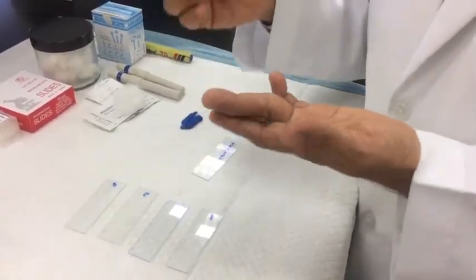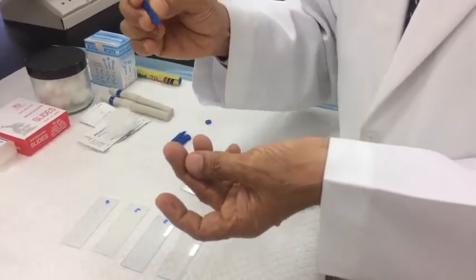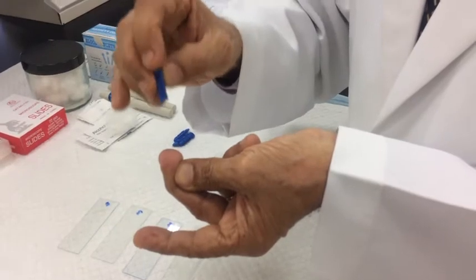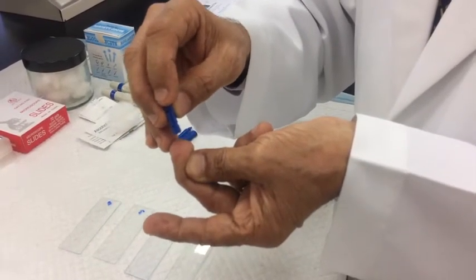Swing the fingers to increase blood flow towards the periphery. Press the base of the finger and boldly prick to get a blood sample — this is how we do it.